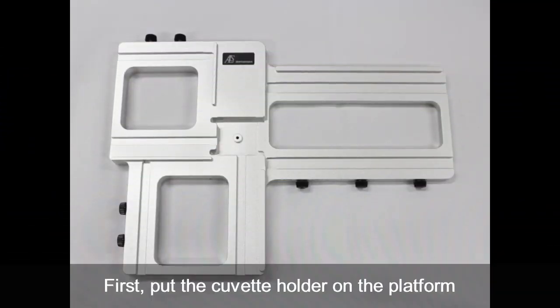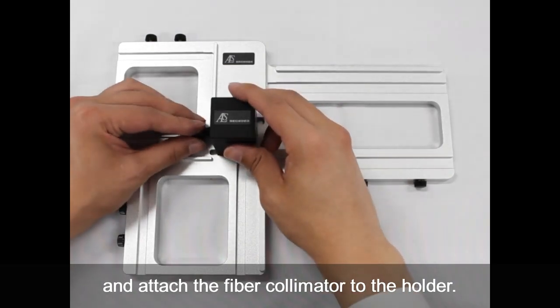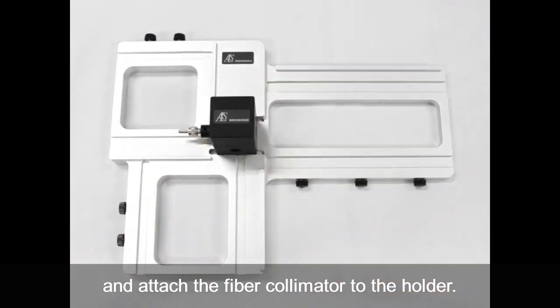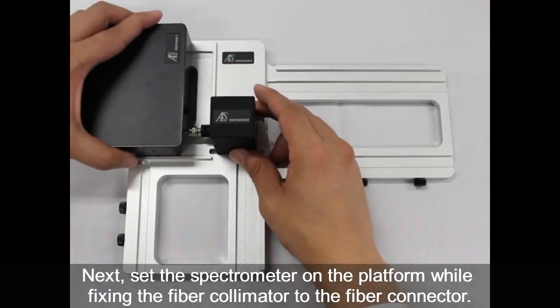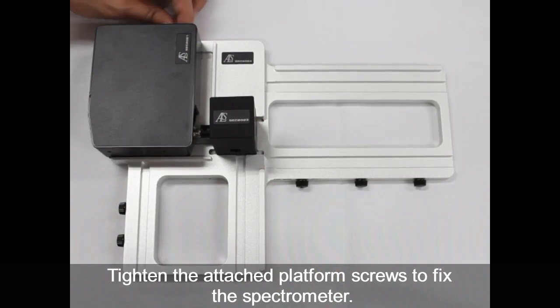For the setup, first set the cuvette holder on the platform, and attach the fiber collimator to the left side of the cuvette holder — the side for the spectrometer. Then set the spectrometer on the platform, while fixing the fiber collimator to the fiber connector of the spectrometer. Tighten the screws attached to the platform to fix the spectrometer.